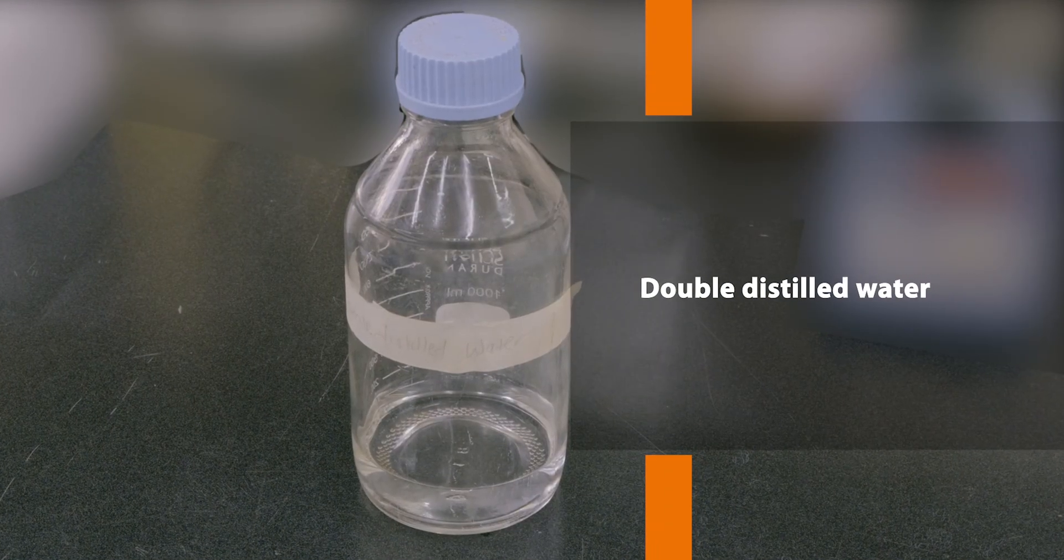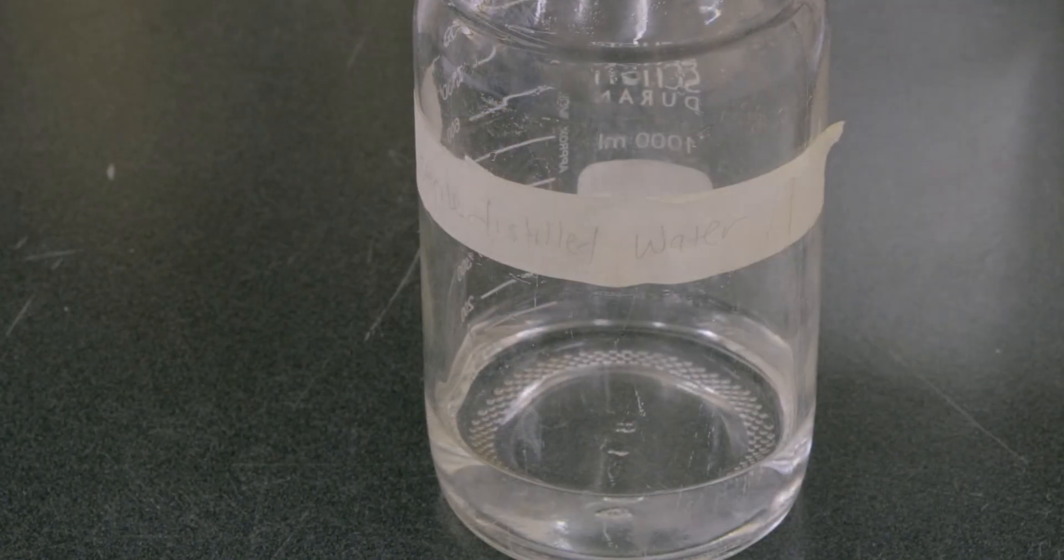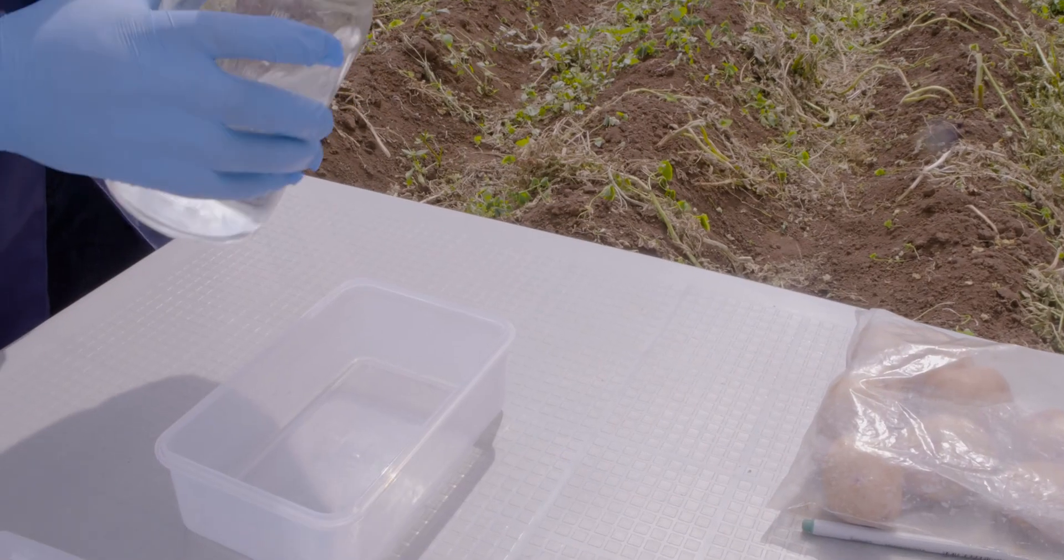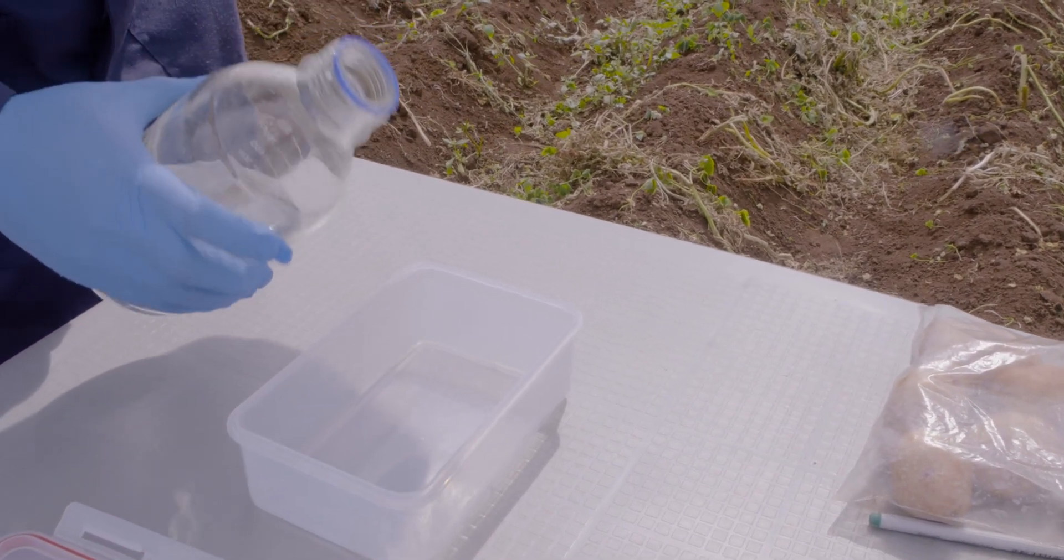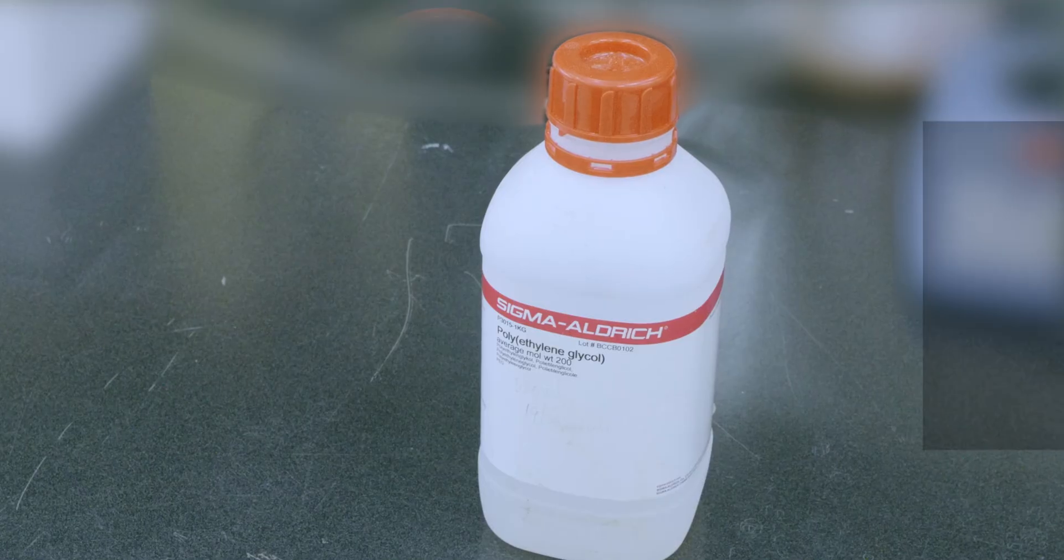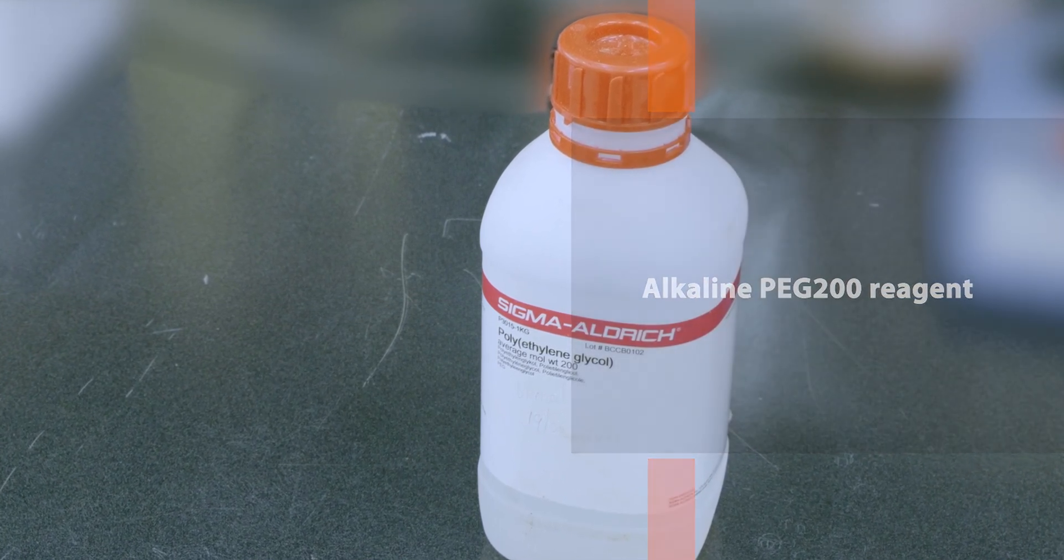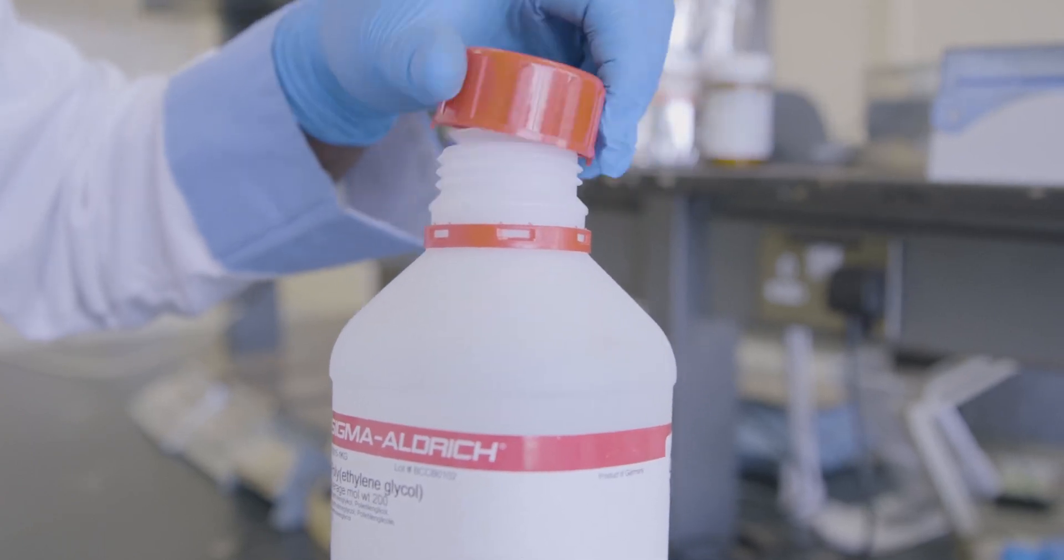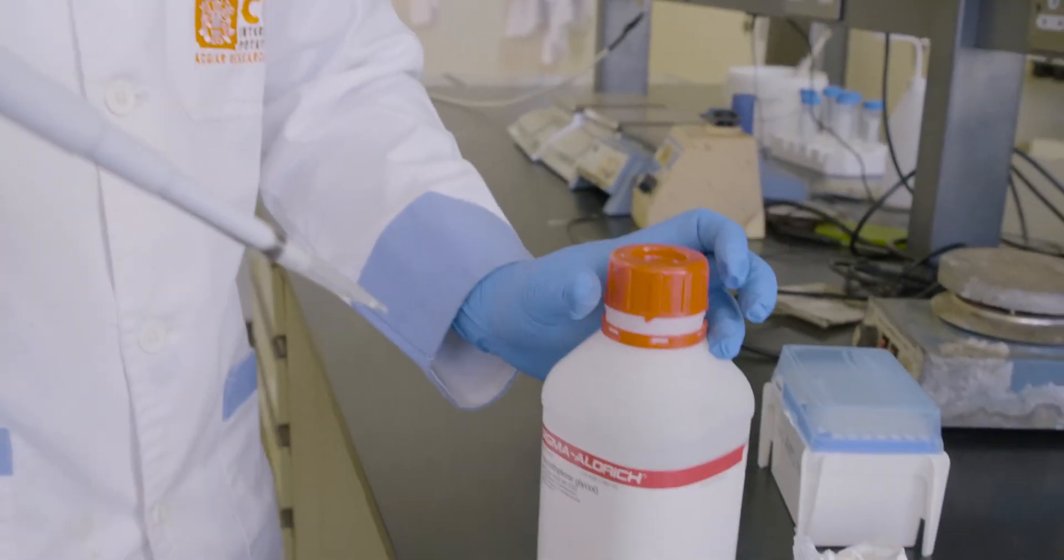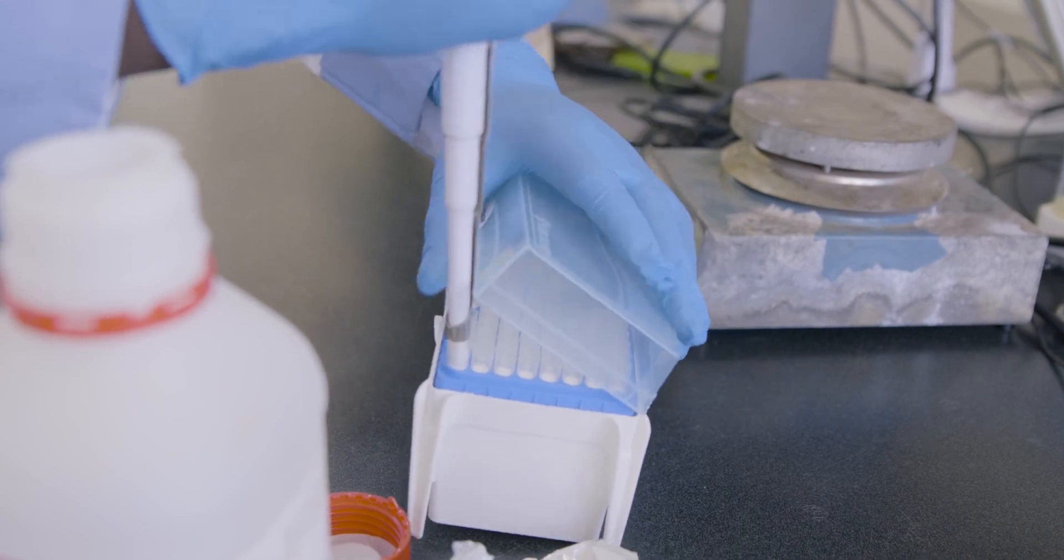Double distilled or type 2 autoclaved water to mix primers. For type 2 water, distilled water is passed through a filter before autoclaving it. This eliminates salts, ions, nucleic acids and enzymes which might interfere with results. Alkaline PEG200 reagent to use as lysing agent for sample maceration. PEG200 captures inhibitors present in the extraction. The alkaline pH denatures nucleases in the extraction which could degrade target nucleic acid in the detection.